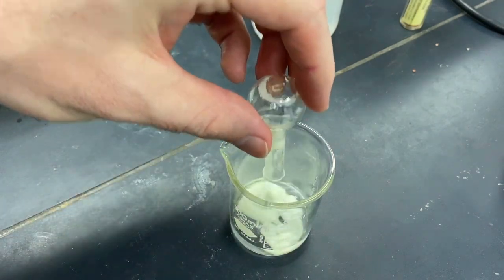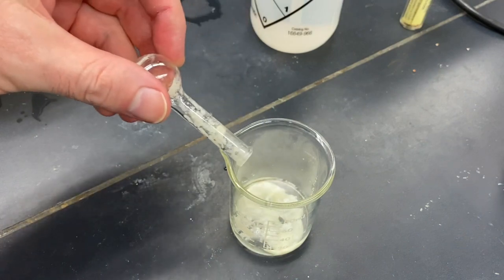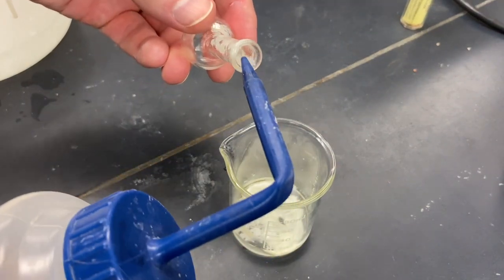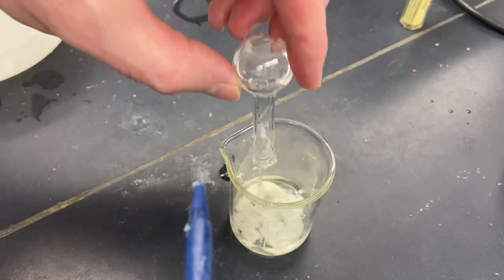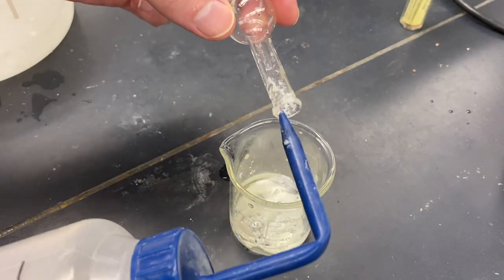We're just going to try to pour everything in, including the stir bar, just to get it out. And I'm going to go ahead and try to rinse this out a little, just with water. And try not to breathe that vapor that came out of there.